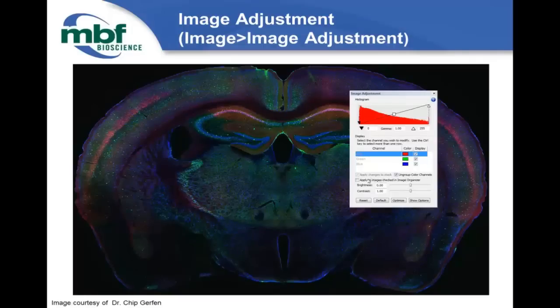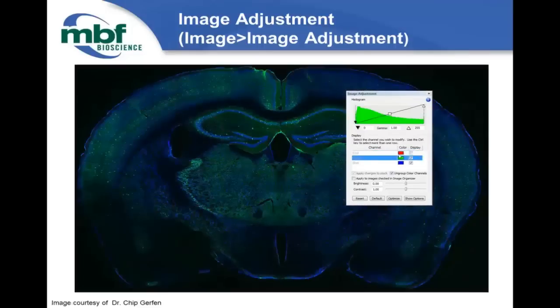You can also apply changes to a full stack, or adjust a single image plane within that stack by unchecking that option. Additionally, you can change what channels are displayed — if you don't want to see the red channel, just uncheck the display checkbox next to red and you'll only see the green and blue channels. You can toggle between channels, display red, green, or blue, and save accordingly.